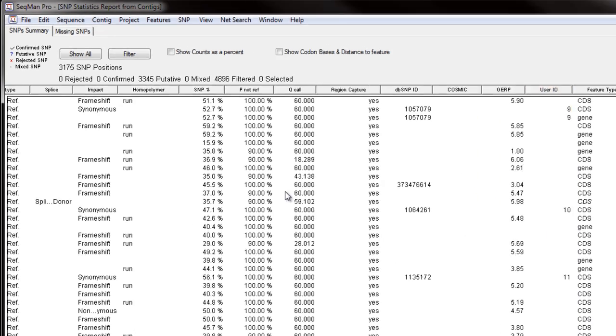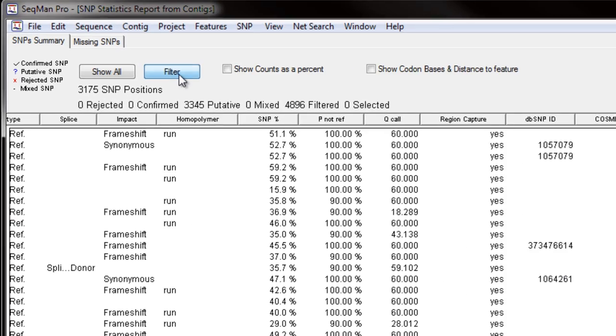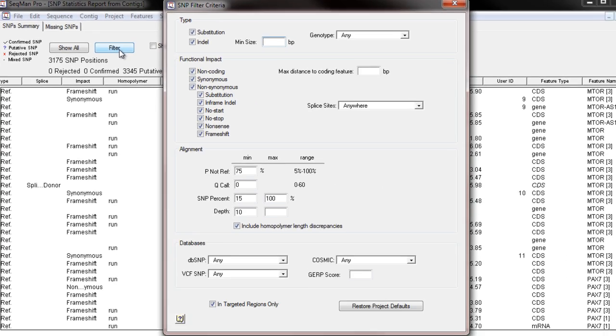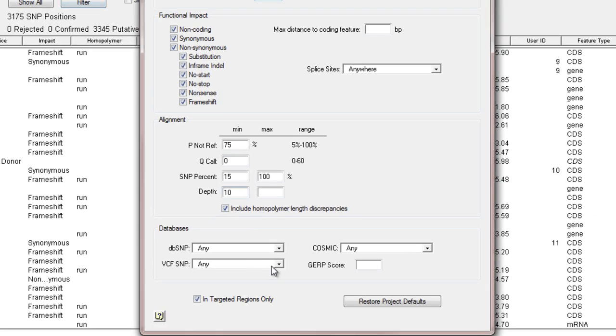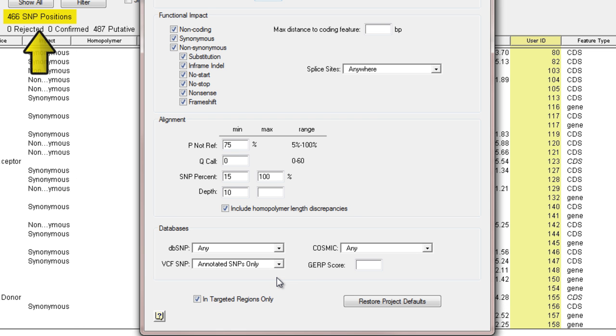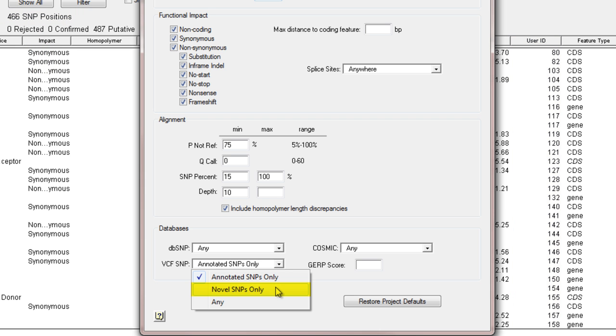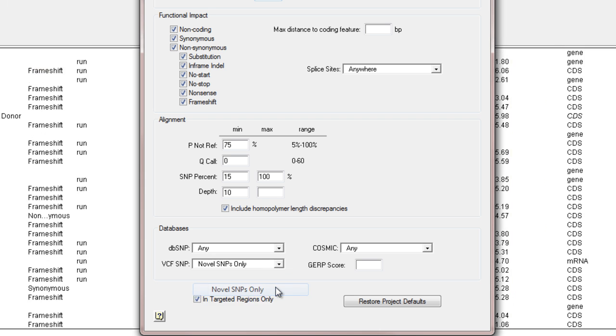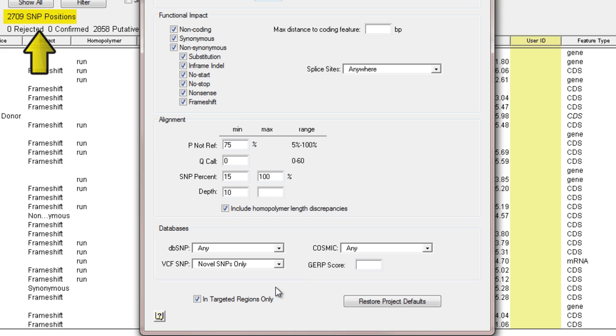We can click Filter to show only SNPs within the VCF file, or we can filter to show only novel SNPs, which are found in our project but are not listed in the VCF file.